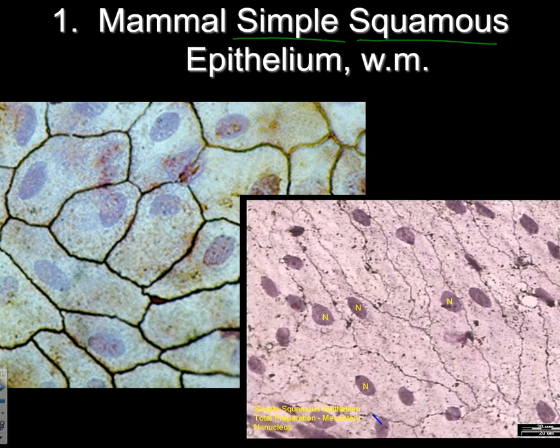Okay, so on this one, we are looking from the top down. So the stuff we are seeing here, when I outline this cell membrane, I'm looking from the top. So I'm seeing the apical surface of this stuff. It's not a cross section. There's a cell membrane, nucleus, and all the cytosol. Cell membrane and nucleus. Same thing over here. A little harder to make out.